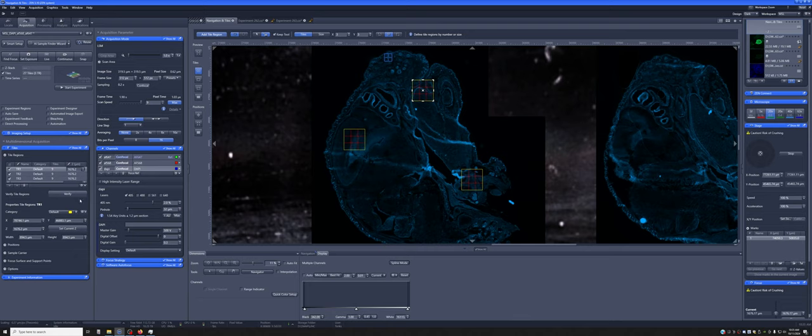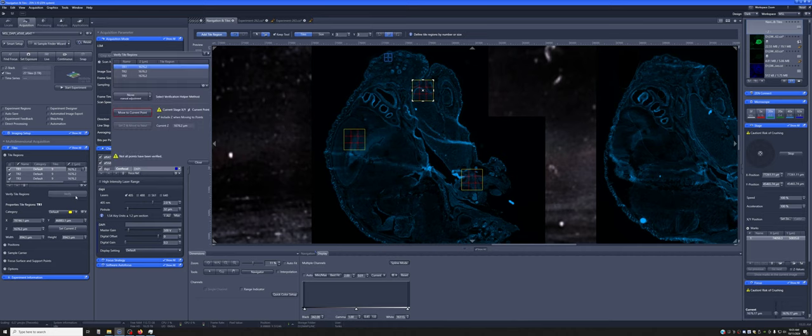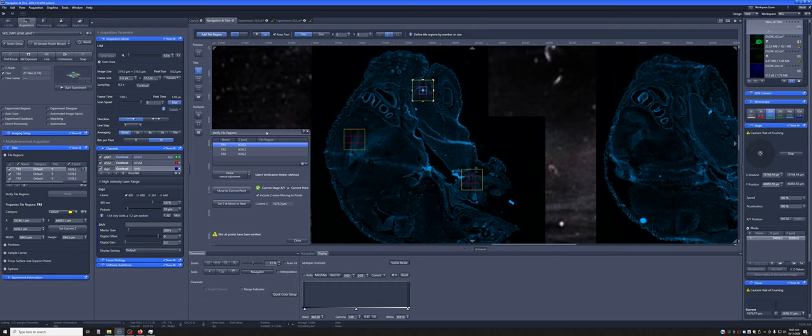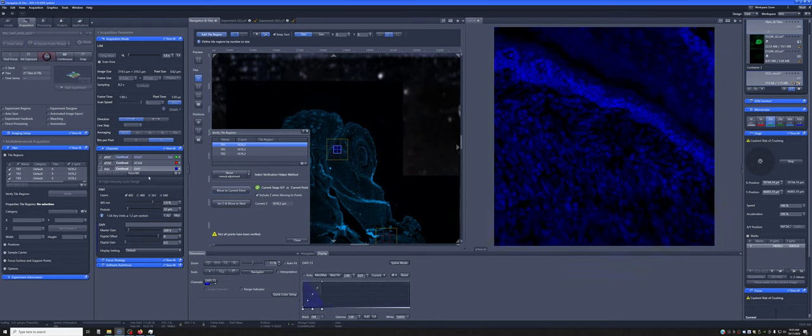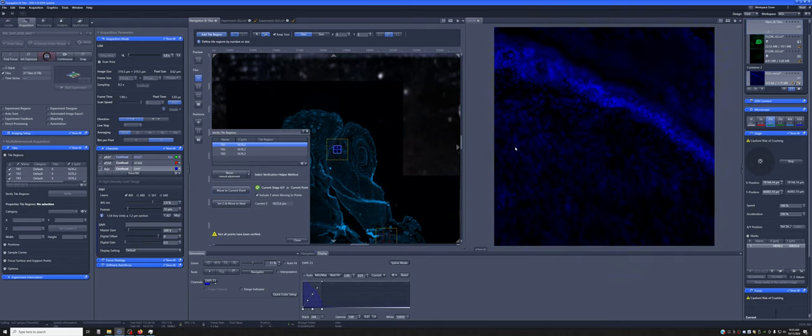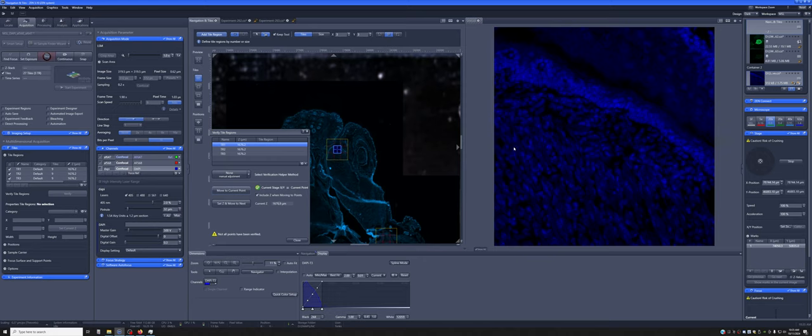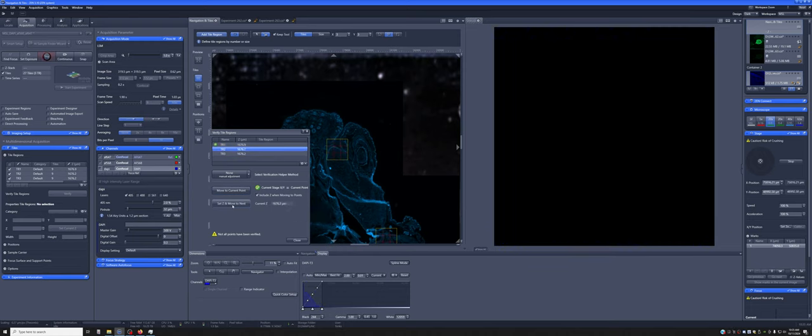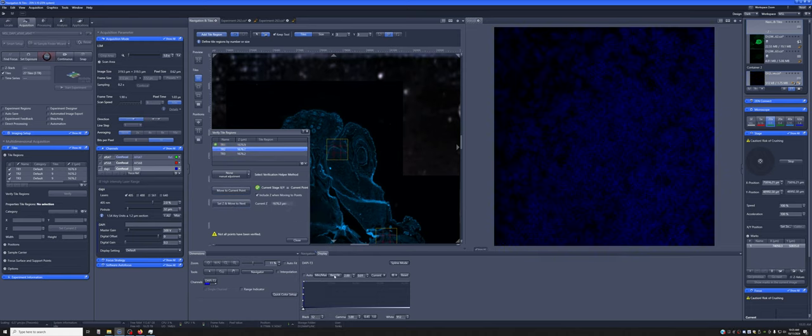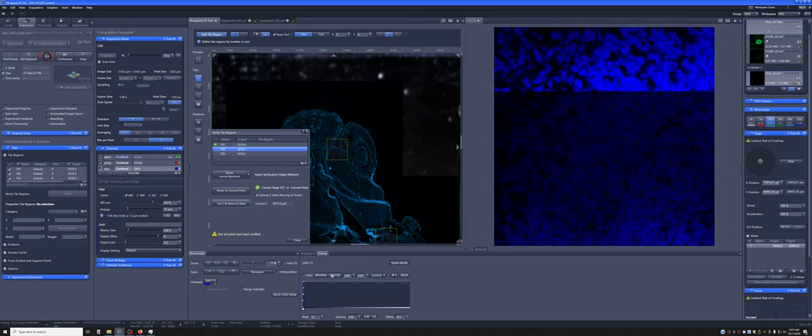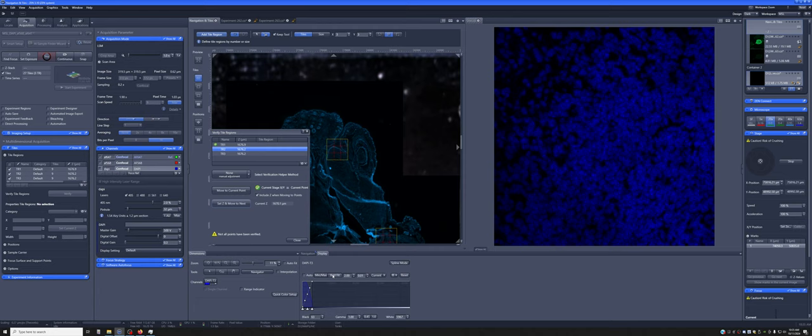You can do that using this Verify button. When you press here, it will prompt you to move to the current point. So it'll move to the center of each of these. When you're in the center, you can go to Live on whichever channel would be useful for you to determine if it's in the proper focal plane. So that looks okay to me. I've just been manipulating the focus with my left hand, and then I say set Z and move to next and do the same in another position. So this one was completely out of focus.